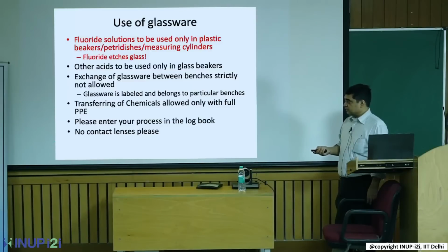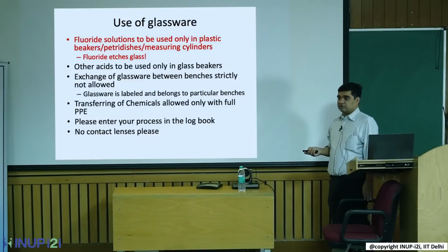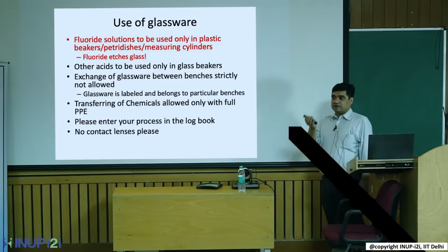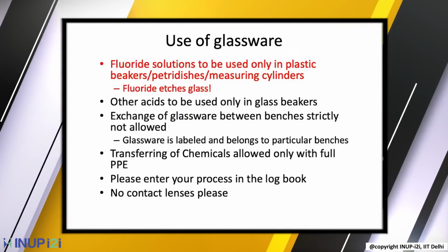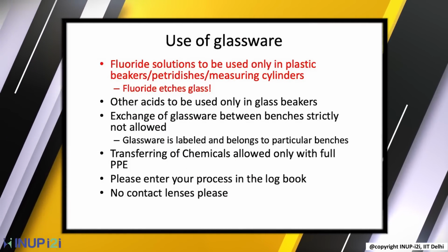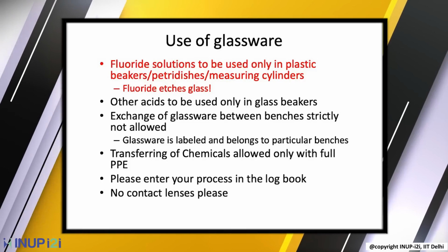No contact lenses. This is very big. Contact lenses are not allowed inside the clean room. Some chemicals or solvents can cause damage to your contact lens and can damage your eye. So we advise you don't wear contact lenses inside. MSDS, I think we have.